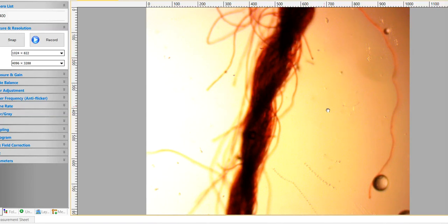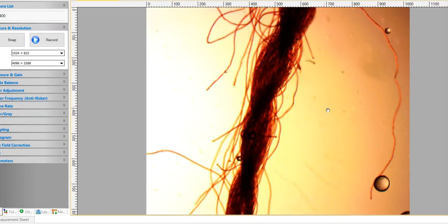So what we do is get it in focus under low power. Oh, there is a good focus. You can almost see through some of the strings right now. And then you can see some bubbles, these little round things. Often I'll say, hey, Mr. C, what's that big round thing right there? Because it looks kind of grainy once you get higher. That's a bubble. You'll see those a lot. Usually if it's round, it's either a Volvox or a bubble.